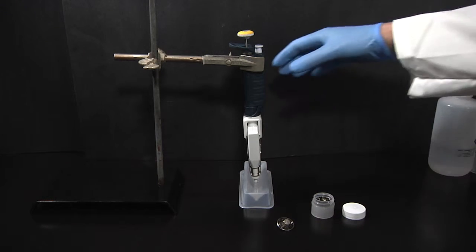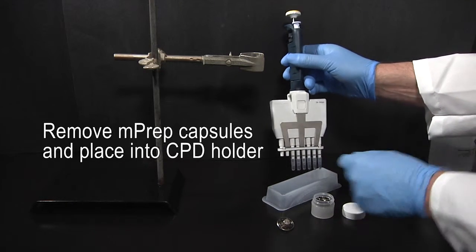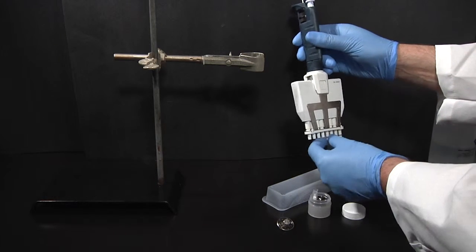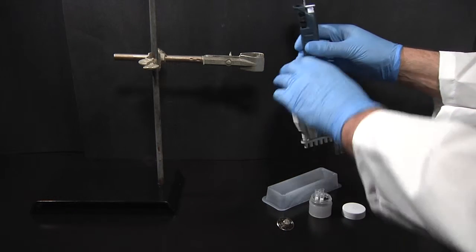Six MPREP capsules are prepared on the eight-channel pipetter because the CPD holder only accommodates six capsules. The MPREP capsules filled with ethanol are removed from the pipette and placed into the CPD holder. Note that the ethanol is not dispensed from the capsules before removal so that the specimens remain immersed at all times.